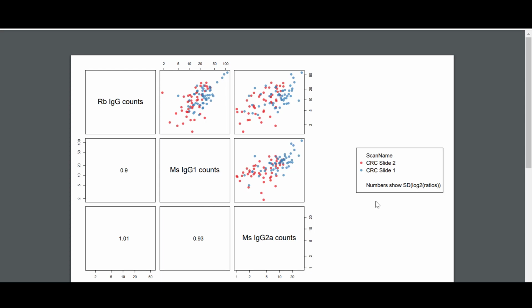Now, if we consider an AOI with double-digit counts, such as 50, it's easy to recognize that a small variability in background counts would not have a significant effect on the data after normalization. Thus, as a general principle, we tend to avoid background as a normalization strategy if counts for at least 2 negative IgGs are not above 20.